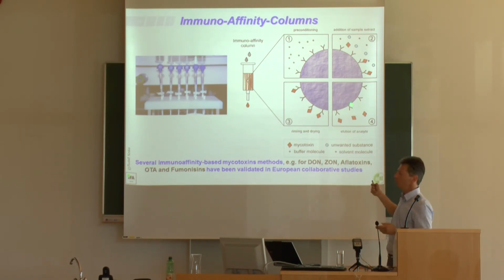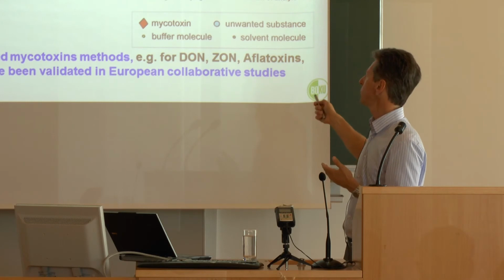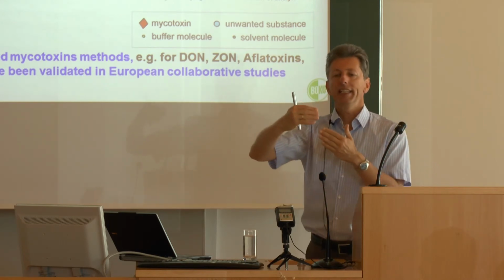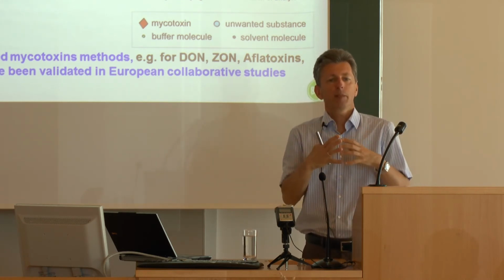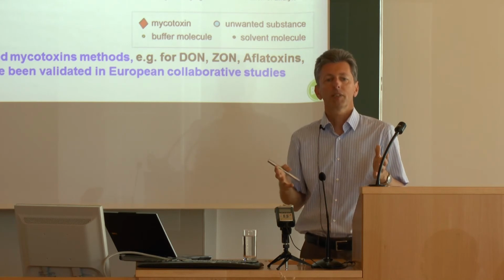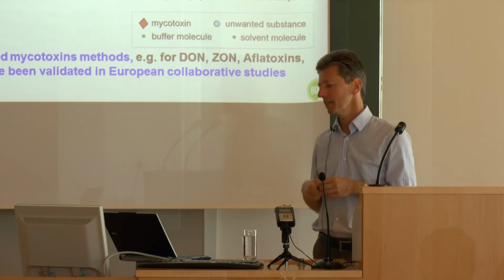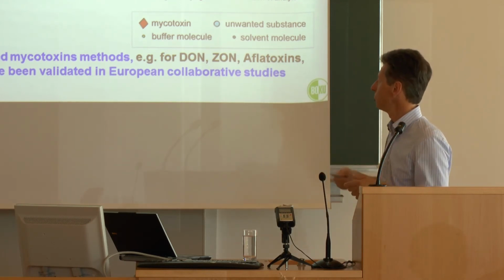Whether it is always needed to use pure organic solvent is to be found out for the individual column. If you would like to save costs, you can find conditions which are organic enough to elute the analyte, so that the antibody releases the mycotoxins but is not destroyed. That is the ideal case. If you would like to be on the safe side, then use pure acetonitrile.